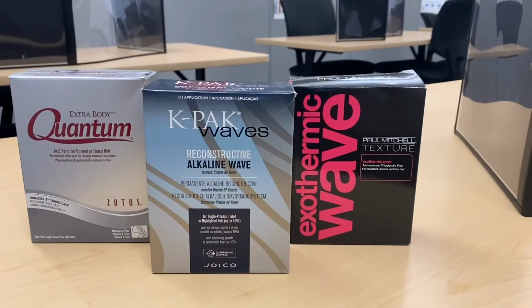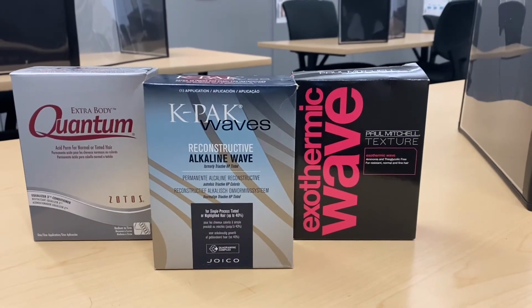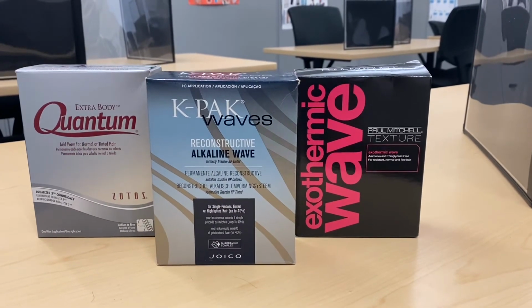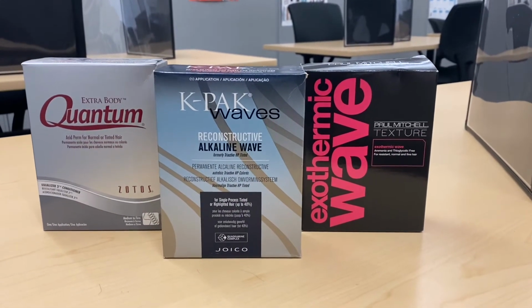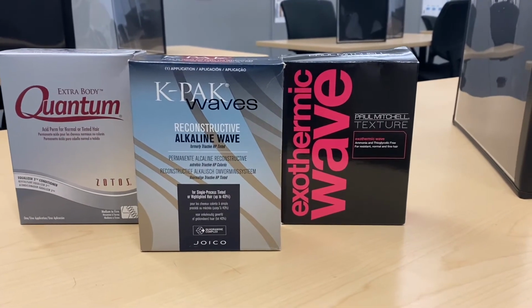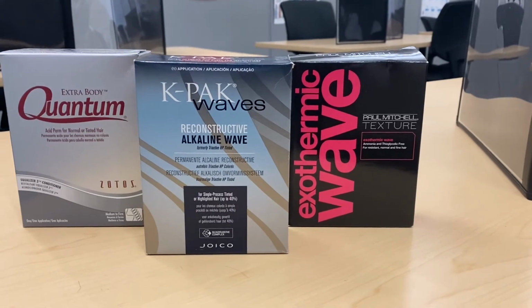Hi guys, welcome back to Hairology with Kelly Carroll. And today our project is going to be looking at our hair underneath the microscope with perm solution on it. So today we are choosing these three perms to experiment on our hair strands that we are placing underneath the microscope to study what our cuticle looks like after it has been exposed to different types of perm solutions.